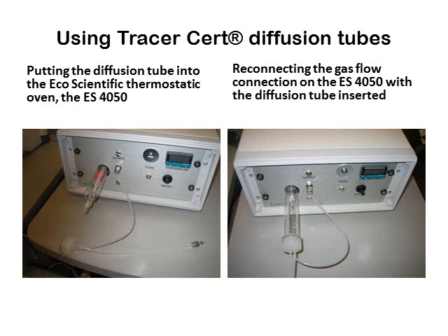After filling, sealing and weighing the tube, carefully place it into the thermostat oven at the desired temperature, with a piece of fine wire wrapped around the narrow neck between the two sections of the reservoir. This is a very simple way of enabling the user to pull the tube out with tweezers when taking it out for the regular weighings during calibration or when you want to refill it.